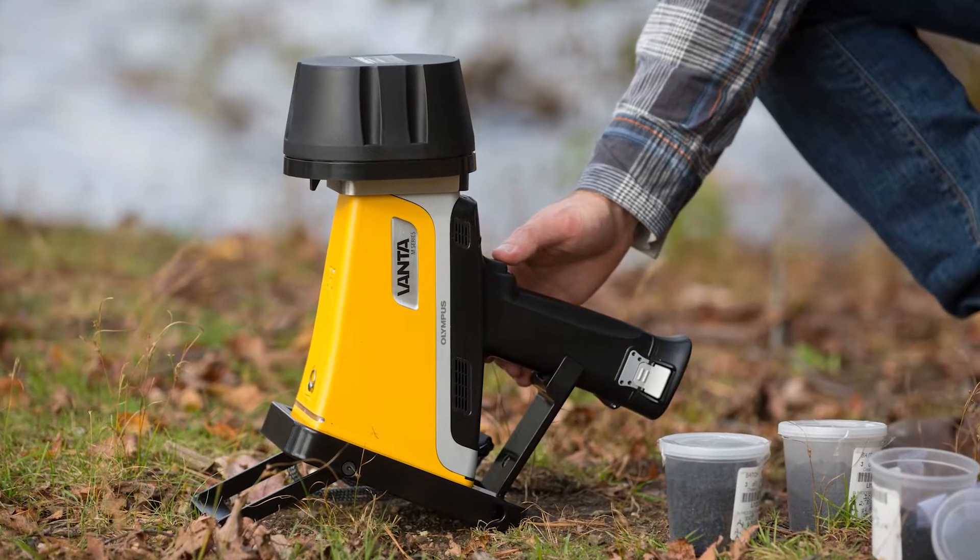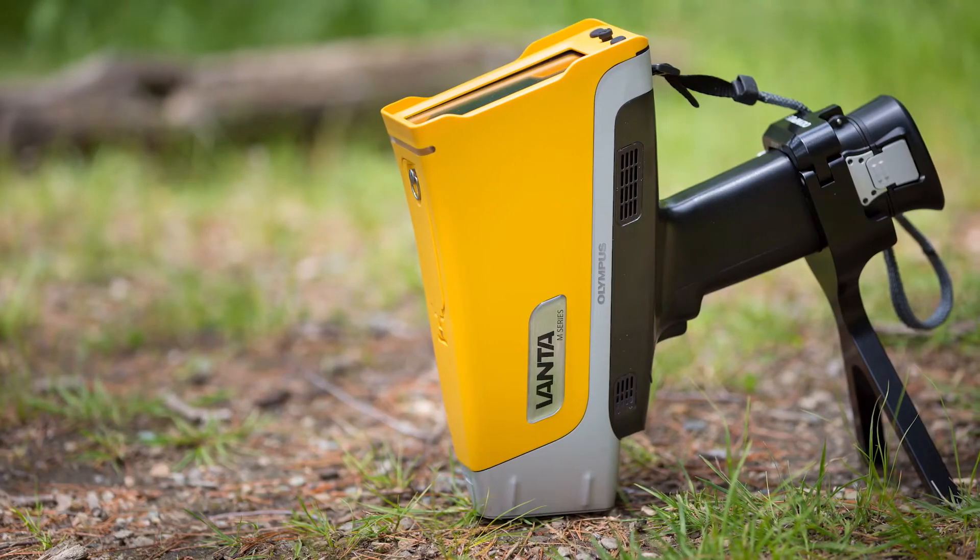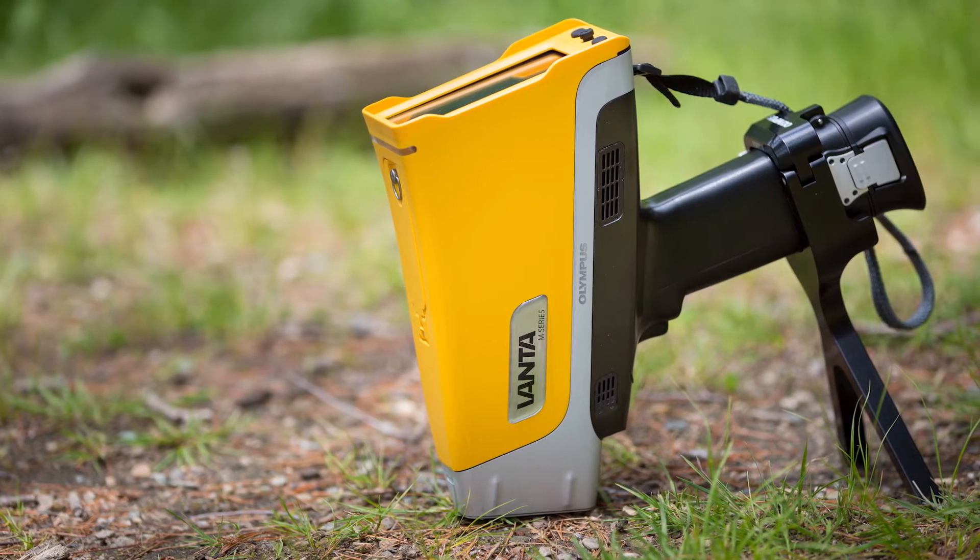The field stand and soil foot are made with powder-coated aluminum, allowing the stand to be rugged enough for use in extreme conditions.